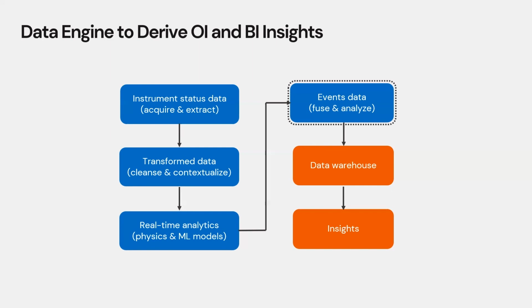It's just a tiny bit, representing the status of the instrument at that moment. So you would really want to be able to do analytics, to look at the data to the left and to the right, and figure out all the significant events and signatures in the data. That's only when you can perform business analytics on the events data. So that's something that we do very effectively.